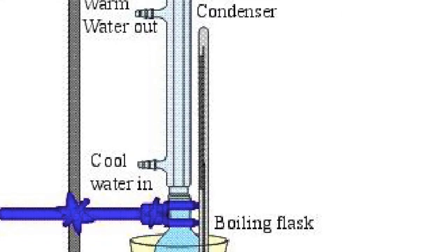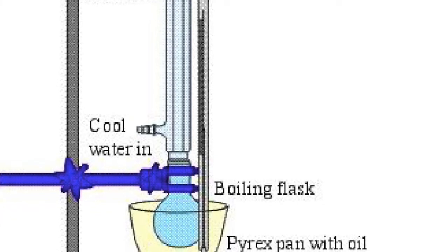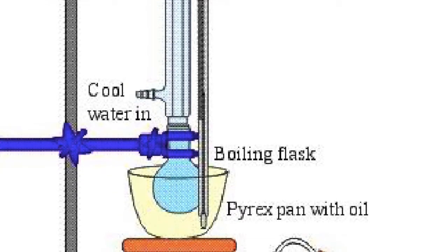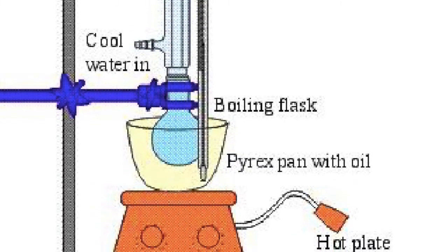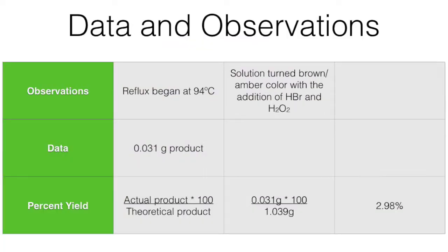Concentrated sodium bicarbonate was added to the mixture at a pH of 2 in order to neutralize it. The final pH obtained was about 6.4. At this point, no precipitate had formed in the flask. Once the solution was allowed to cool, a white-colored precipitate started to form.